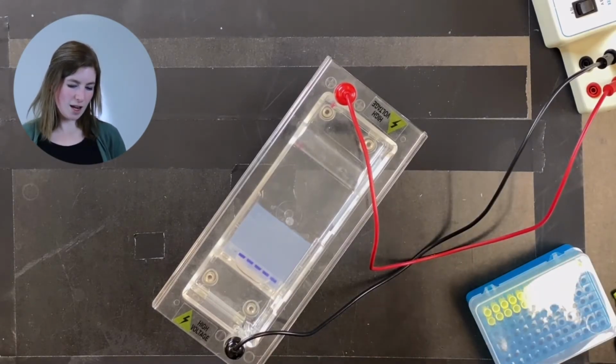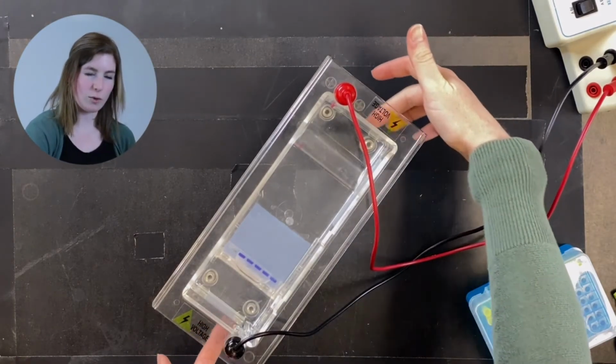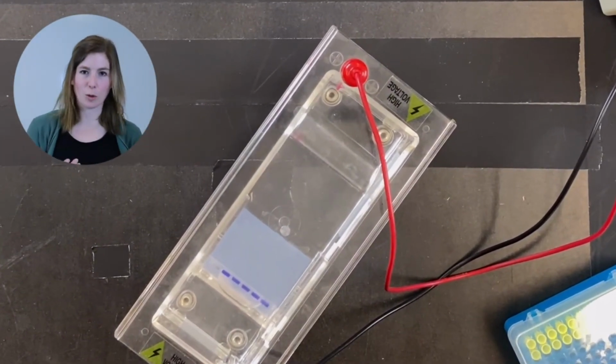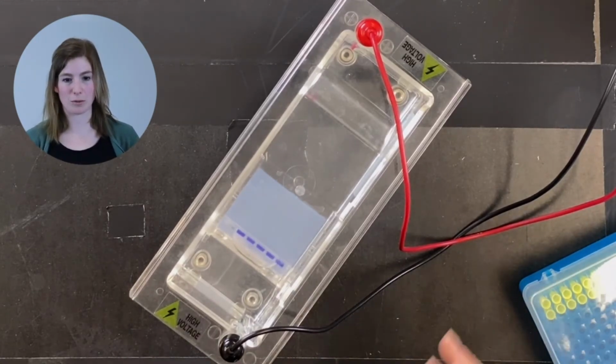And you may not be able to see this on the video, that's fine, I'll tell you what I'm seeing. On both ends here, I see kind of what looks like a metal wire. And if I look down to the side, I can actually see little bubbles coming off of them. And that indicates that my power source is working, right? There is electricity moving through this.